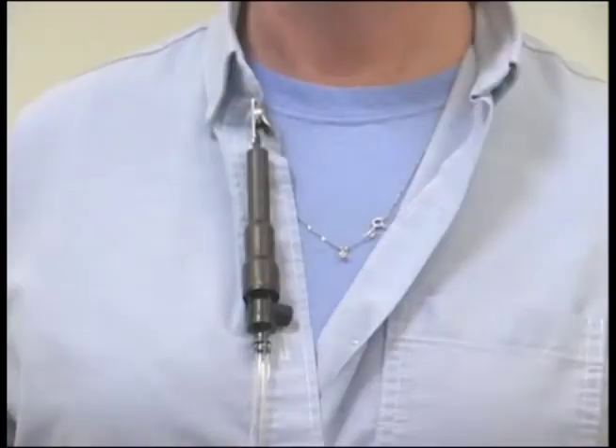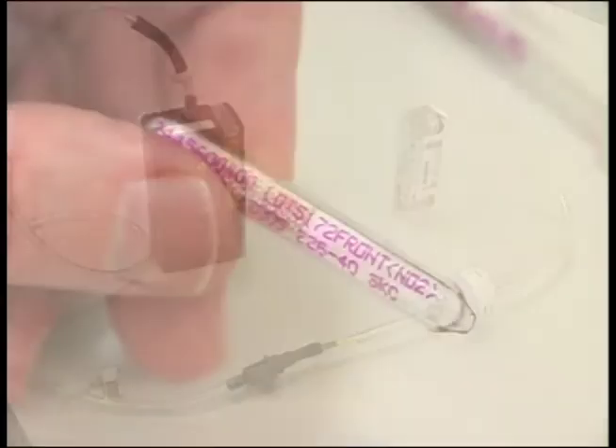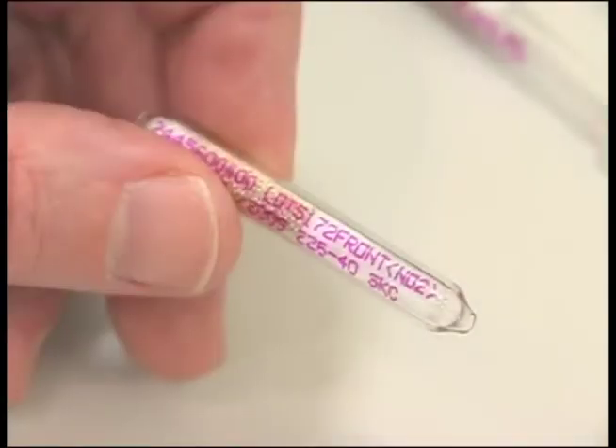Be sure to use the tube covers whenever possible to protect the employee from the open ends of the glass tubes. Tube covers cannot be used when a pre-filter must be used or with a sampling train that has multiple tubes.